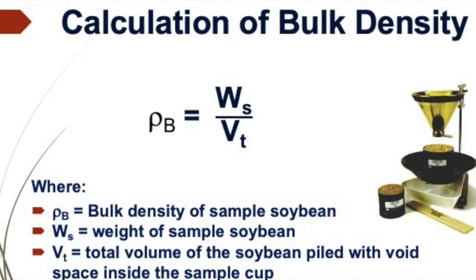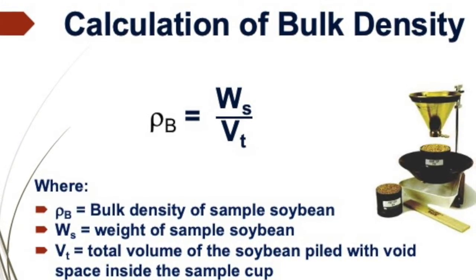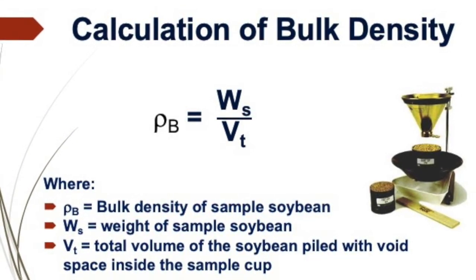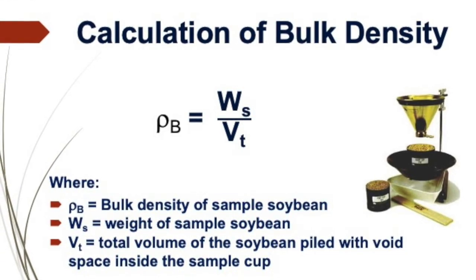After getting the weight of sample, the volume of cup is known as 100 ml or 100 cubic centimeter in our lab. And then directly calculate the density using the equation, the weight divided by the volume.